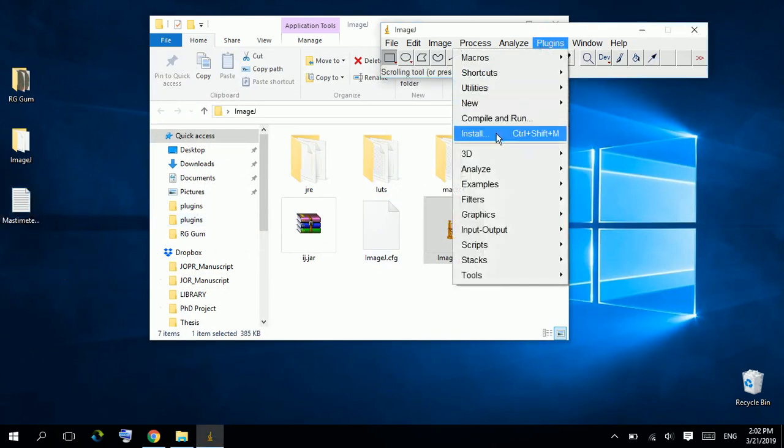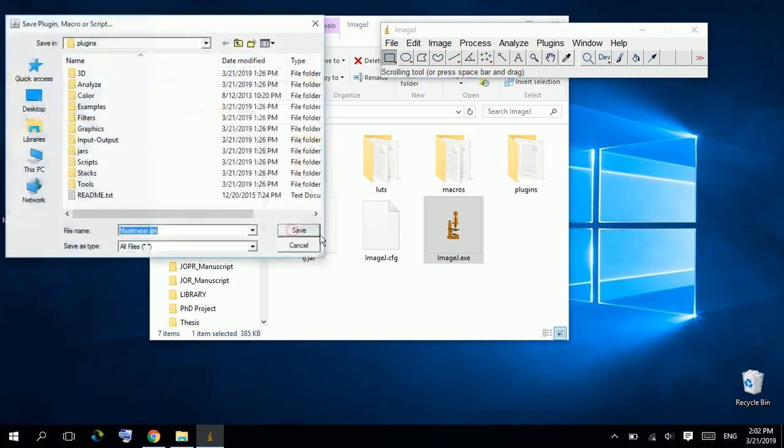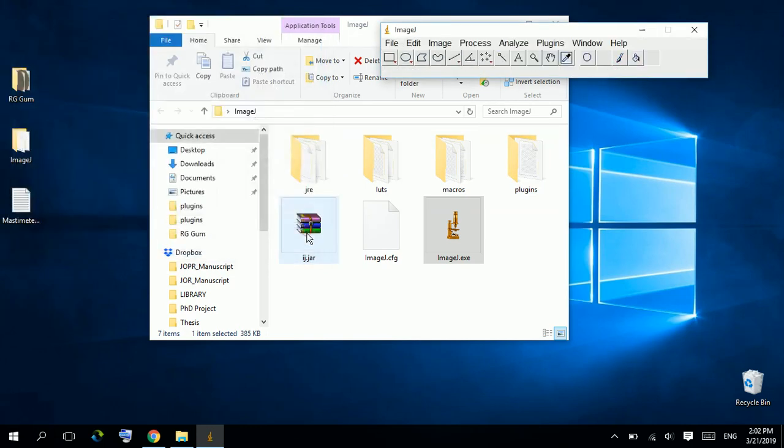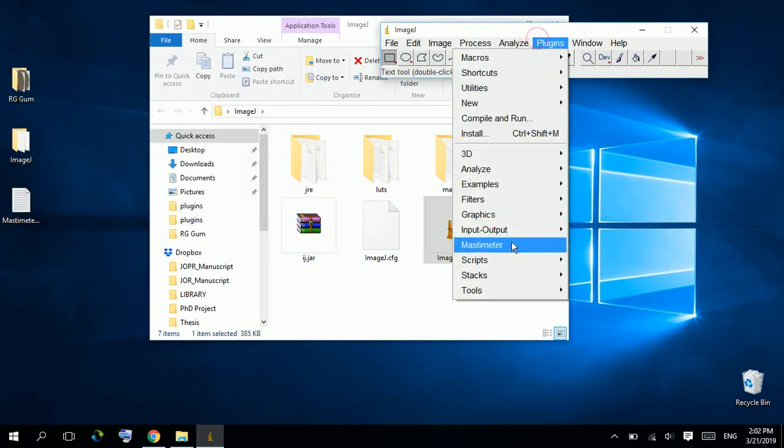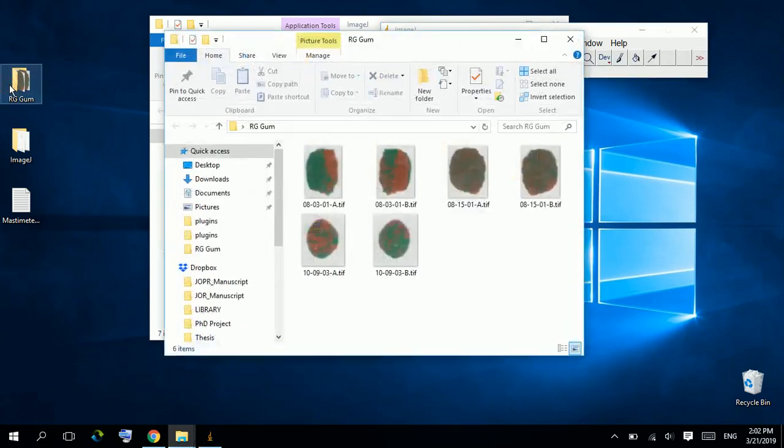Go to plugins, install Mastimeter. This is Mastimeter within the plugins menu. Let's try this plugin. I have specimens of two color chewing gum.